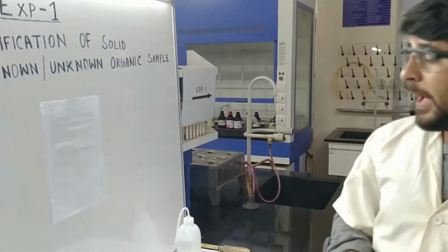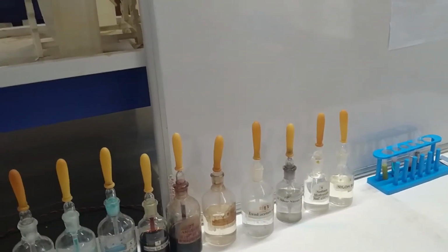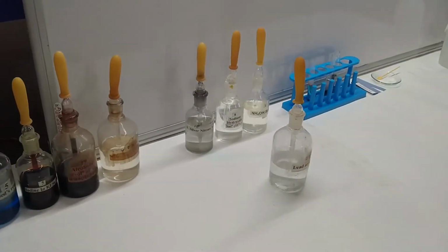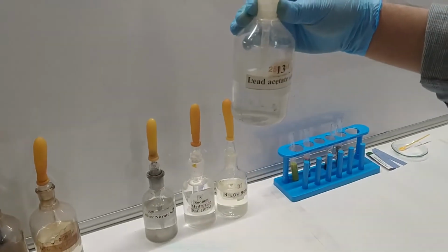Here we have to add lead acetate solution into the aqueous solution of glucose.